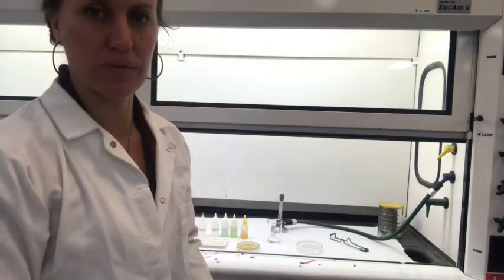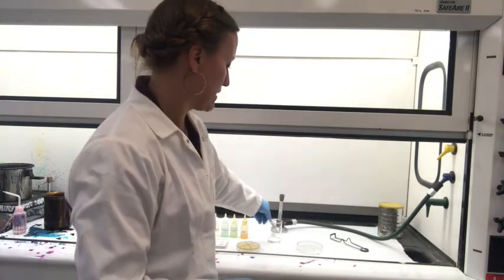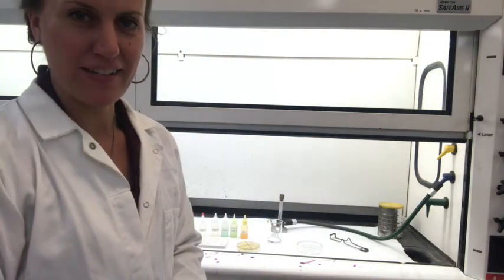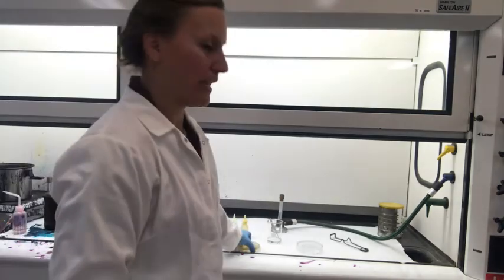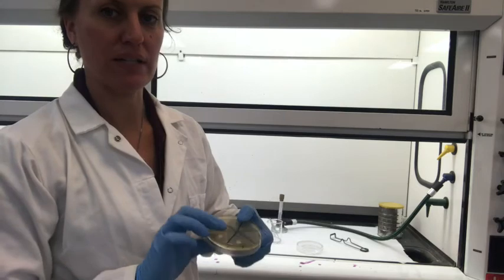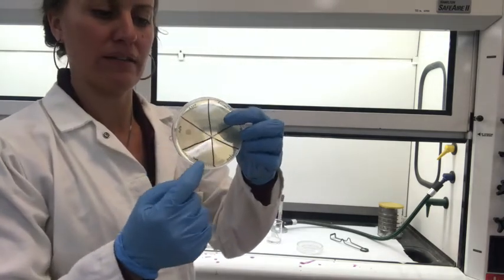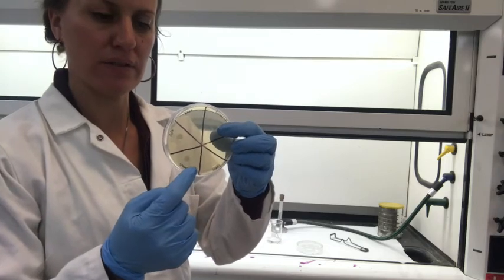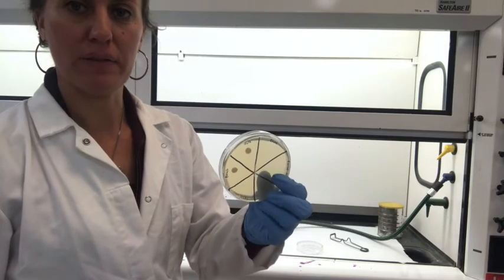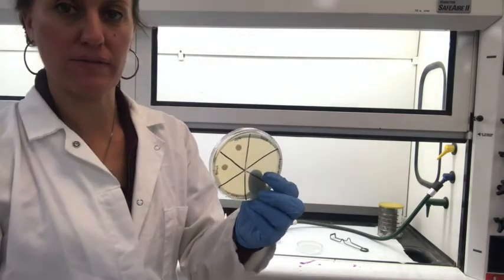This exercise you will continue until you've moved through all of these different types of disinfectants and saturated all of the discs to put them on the agar. As soon as this is done, this will stay inverted, taped around the edges, and put into a 37-degree incubator for a 24-hour period. And then we will be evaluating the zone or the circle around each of these discs that we call the zone of inhibition, and we'll give you a couple of demonstrations or a couple of plates to show you what these zones of inhibition look like.